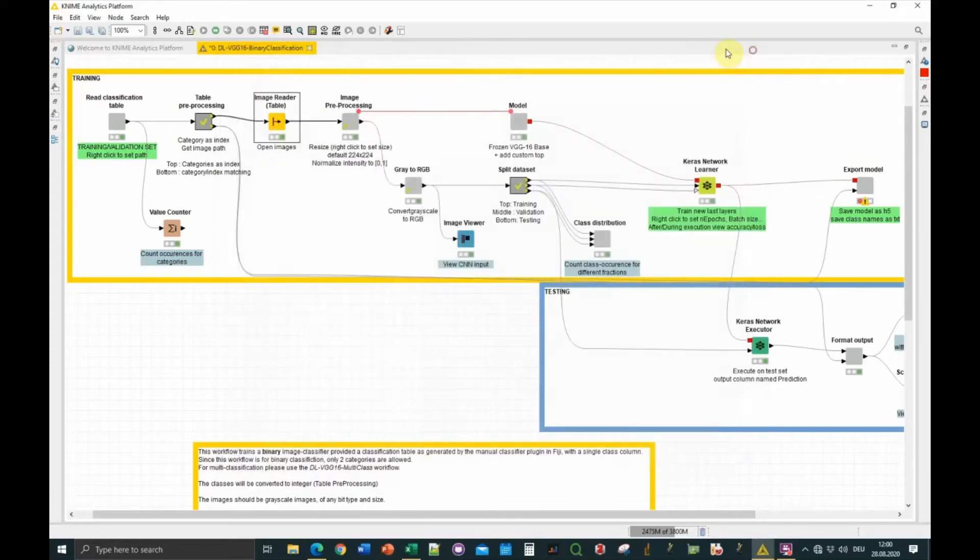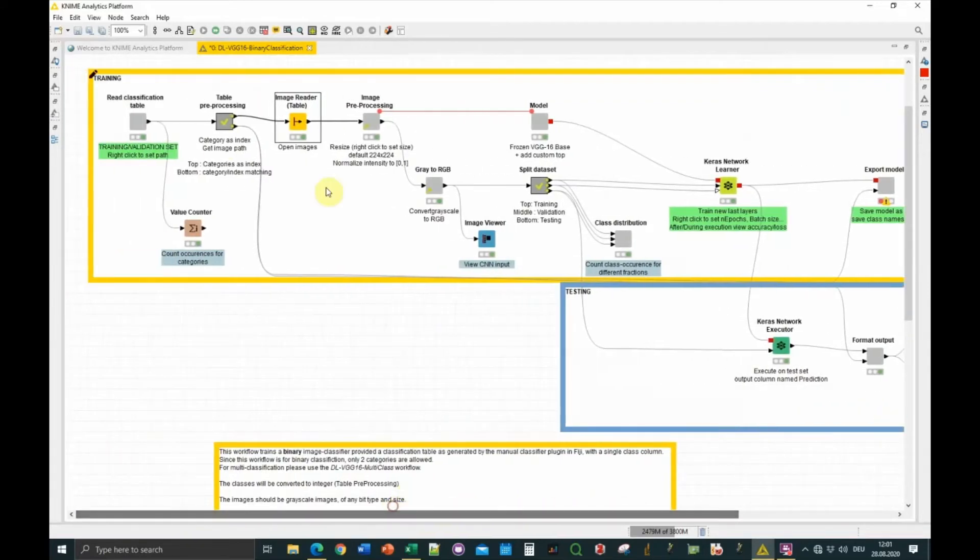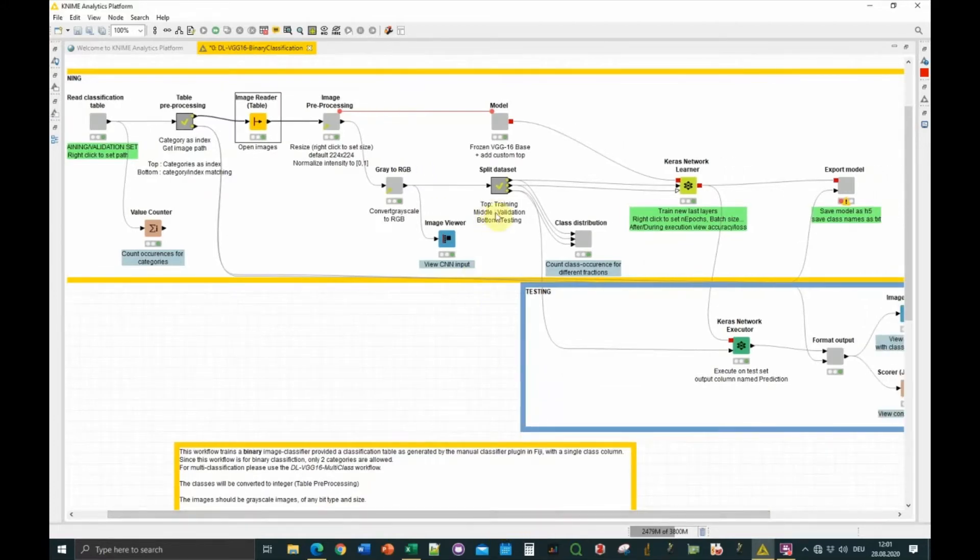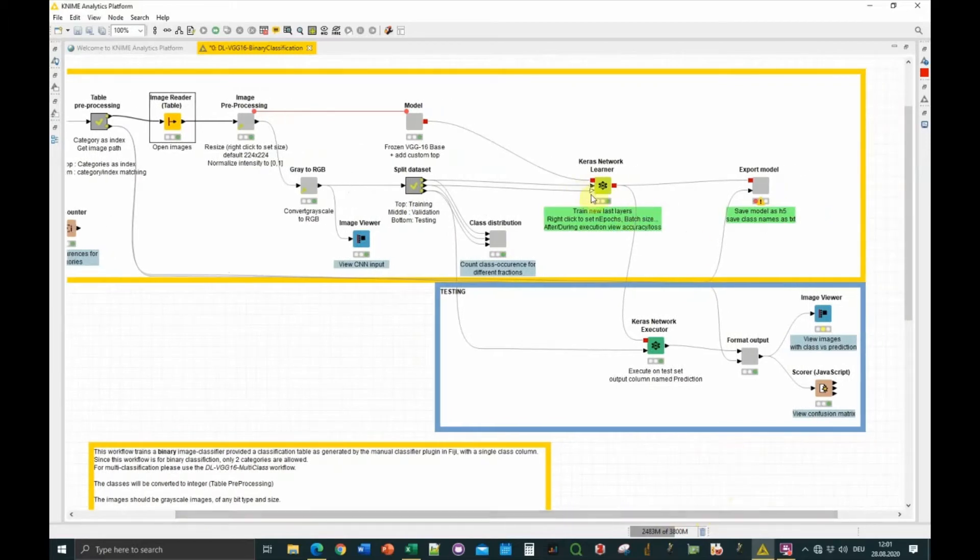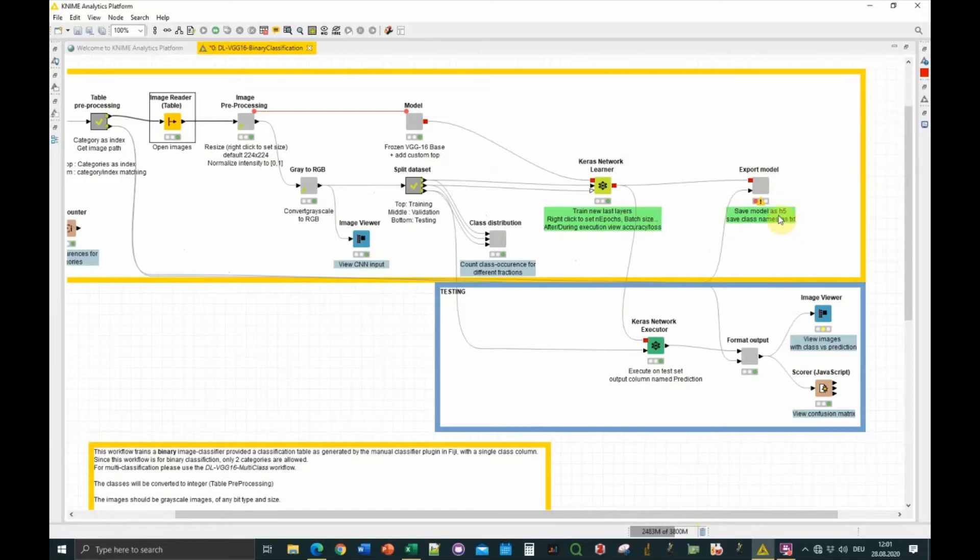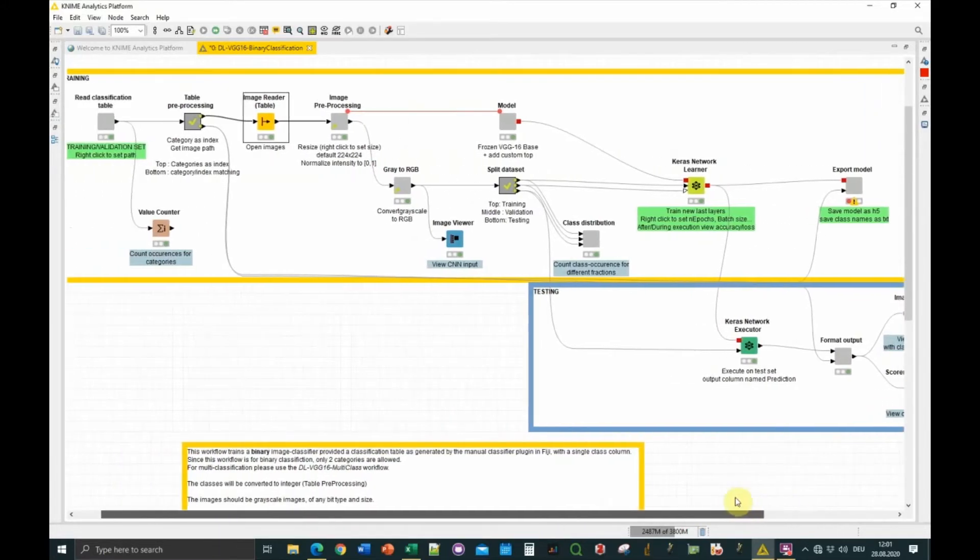This workflow is pretty big as you can see, but it's doing all the process from data preprocessing, so it's compatible with what the workflow is expecting, then training the workflow on the training set and evaluating its performance on a test set of images. Finally, you can export the model, the trained model, so you can do prediction on new images using your H5 file, and you can visualize the performance on the test set to see how many images were correctly classified.